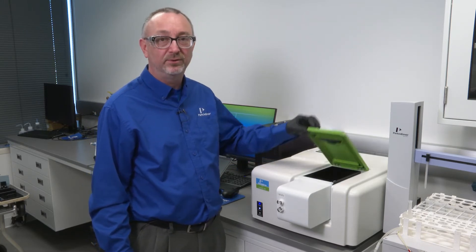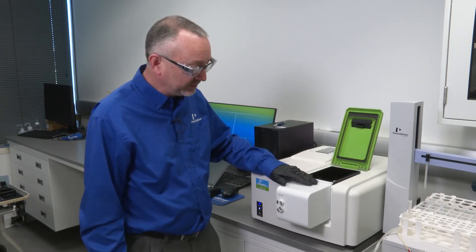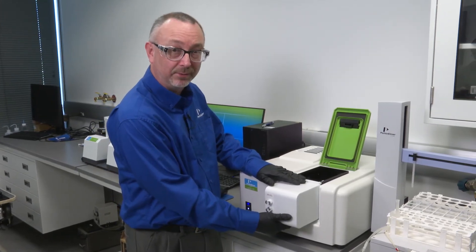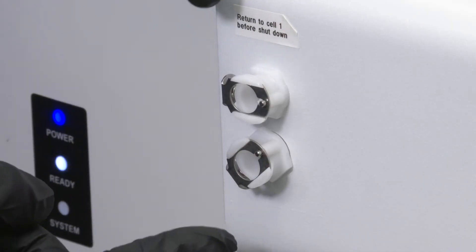In this case, we're going to look at eight liquid samples. This is the cell changer here. This simply installs — there's an electrical connection underneath, so this needs to be done with the power off. In this particular one, we have an in and out for coolant water.